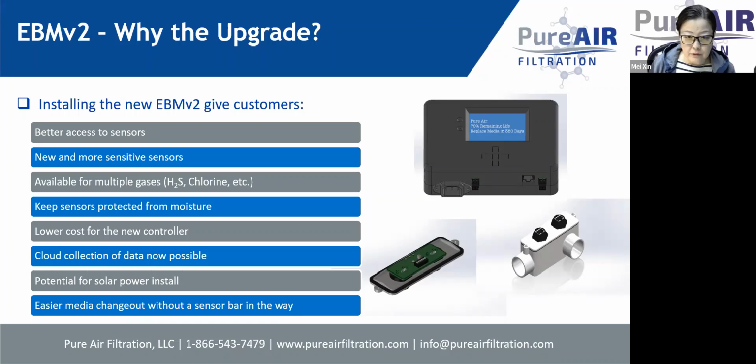Another significant change is that in the old version, you have a sensor bar in the bed. Now it's easier media change out without the sensor bar in the way. So there are several benefits. You can calculate the benefits to see if you need a new sensor system.